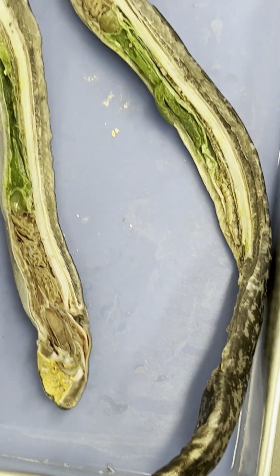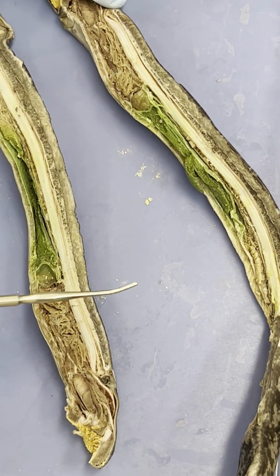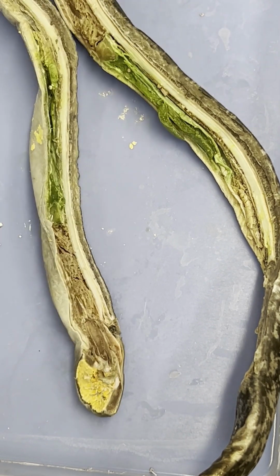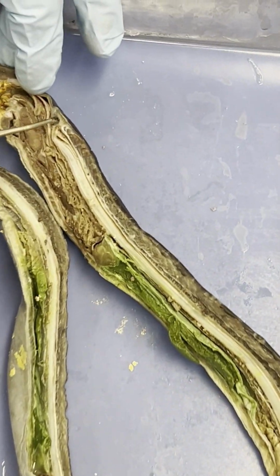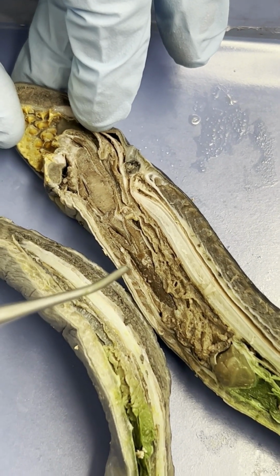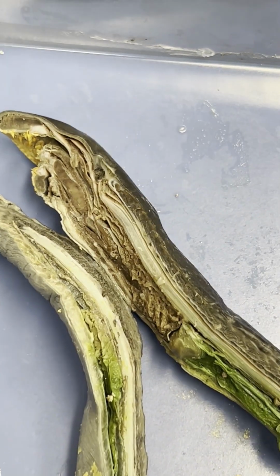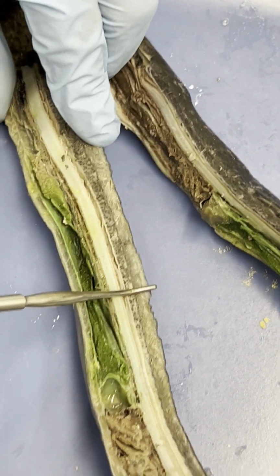these specimens, and remember, you're watching this video right now, and you might be thinking your specimen is going to look exactly like our specimen. But if you remember the frogs, that's not always the case. So orient yourselves, find a structure. For example, if you could find the olfactory bulb, which is relatively easy, you have an idea that the pineal gland is going to be here and the brain is going to be there as well. So orient yourselves, watch the video, read your lab manual, do what you need to do to make sure you know these structures and you can say and properly spell these structures, because I'm trying to prepare you as best as I can for the practical. Okay?